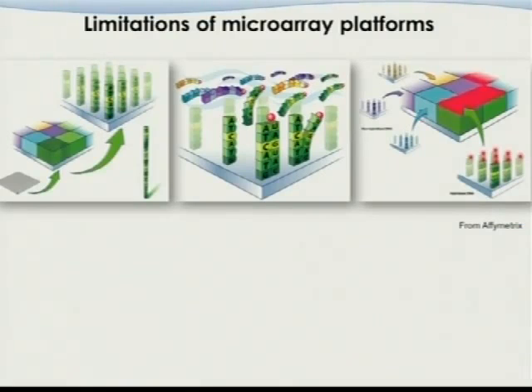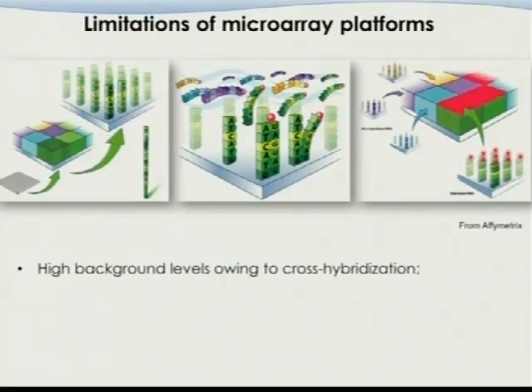And then after that, what you do is take a very fine image of the entire thing, and count how many red hats are collected in each individual compartment. The higher the expression level of that particular gene is, the more signal you will be able to detect. And that is the basic principle of it.